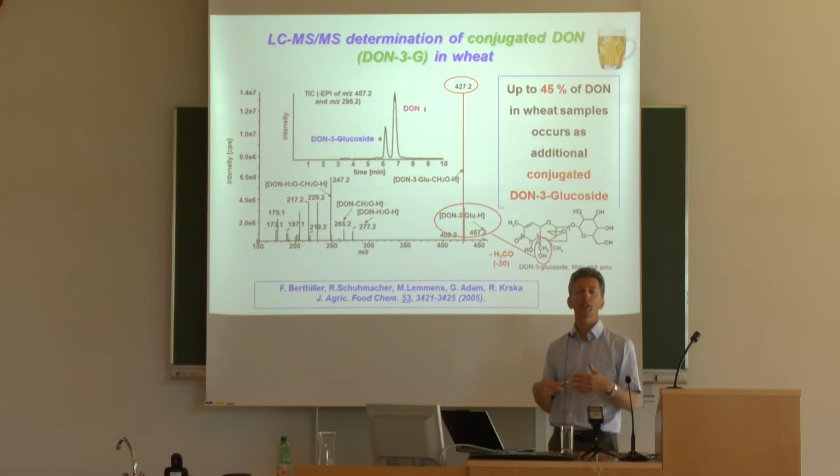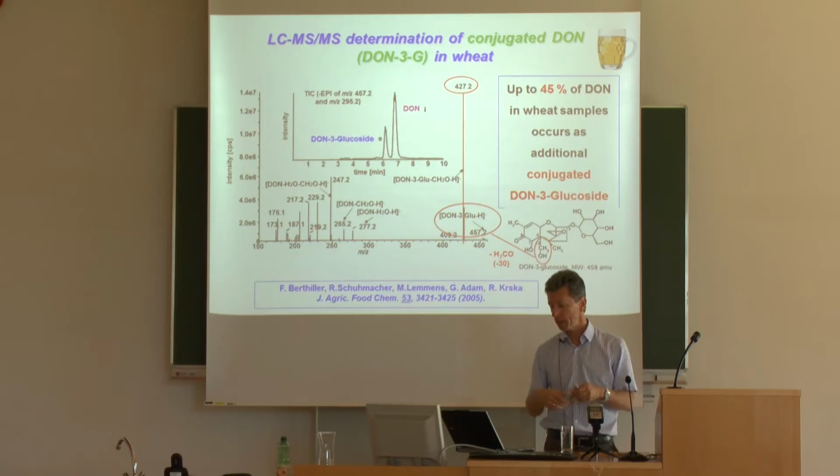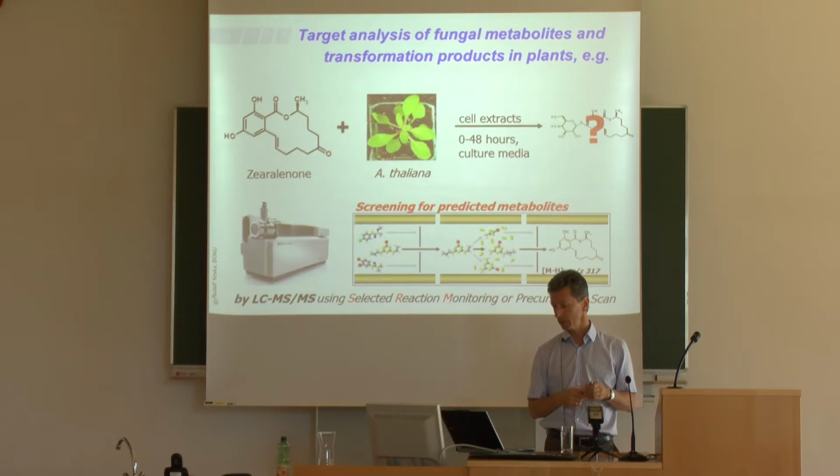which can certainly have implications also for food safety, especially in case the parent mycotoxins might be released after enzymatic hydrolysis in the gastrointestinal tract. And this can also be used for targeted analysis of fungal metabolites.